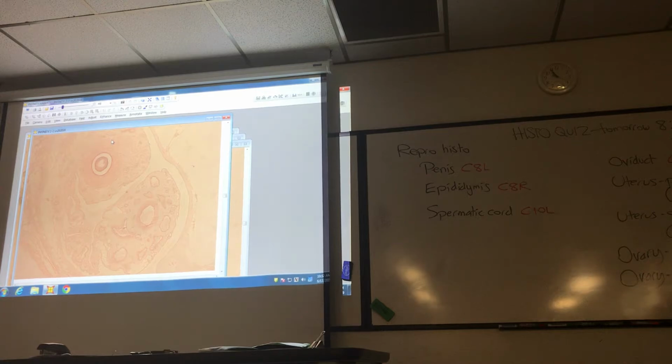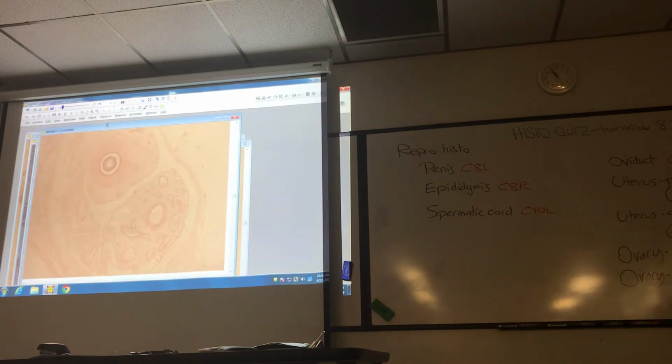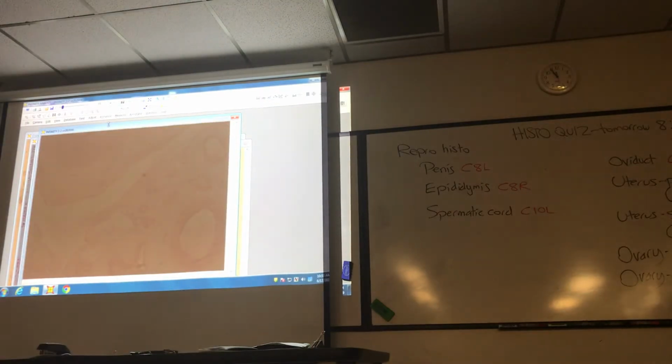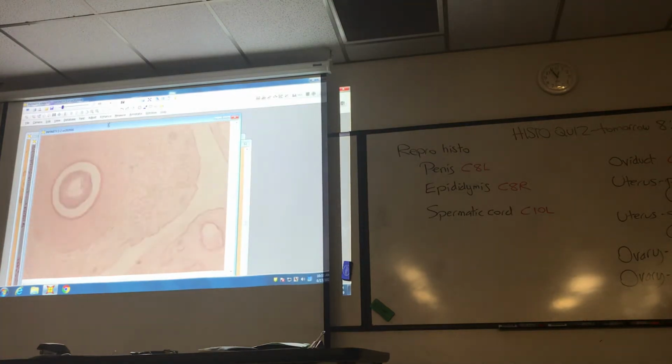Okay, let's go to a higher mag. Picture that. This is 100. We'll go to 400. What I would like to do is get that in 400. That's the vas deferens.